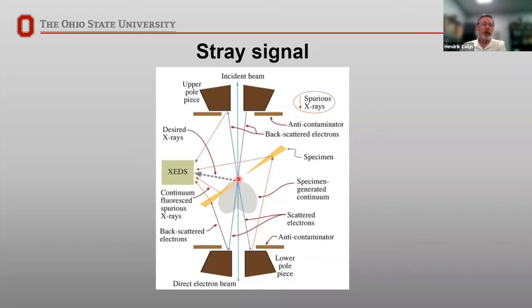The high energy electrons coming in can scatter from your sample and go over and hit your support grid, so you will often see some sort of background signal. If you have a copper grid, you'll see copper, or you can always choose a different grid material, gold or titanium or something like that. So you tend to choose a grid material that will not interfere with the type of analysis that you're trying to do. So you do pick up some stray signal, but it's not nearly as bad as it used to be.